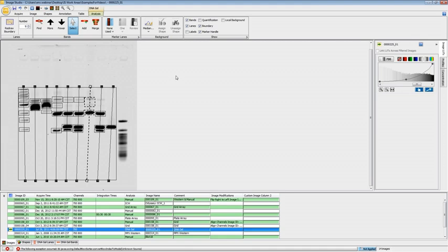So once you have edited your bands, defined what you need, you want to choose a molecular weight marker. And one of the presets that comes with this is the Lambda HindIII marker. So I'm just going to choose that one. And I'm just going to use one marker lane. You can use up to 3 if you want, but I'm just going to use 1 for this particular image. Now, if the marker lane was not in the left-hand lane, that's where Image Studio assumes that you have run it. If you highlight this M1 and move this, now this becomes your marker lane. So it's pretty straightforward how to set up your marker lane.